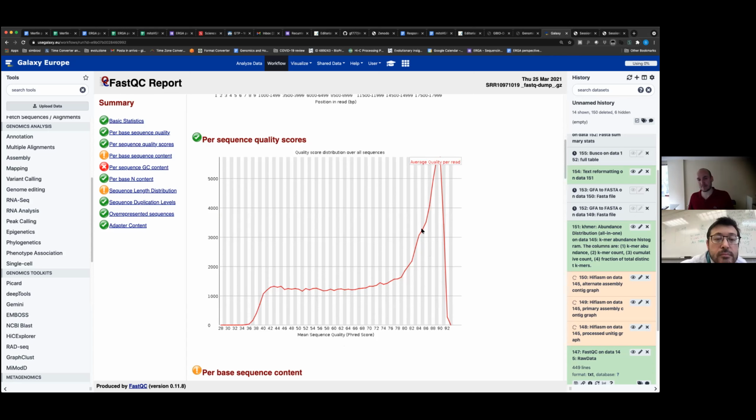You can actually apply rules to filter out this stuff, and so you get a much better and much tighter distribution here. But again, it's more a mixed population of reads. This is because, if you remember how HiFi reads are generated by this consensus approach, you go in circles around the molecule. It's a stochastic process, so it depends how many times you actually sequence the same molecule. It could also depend on the length of the molecule.